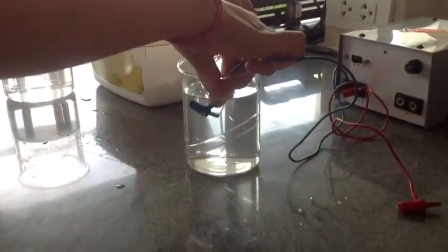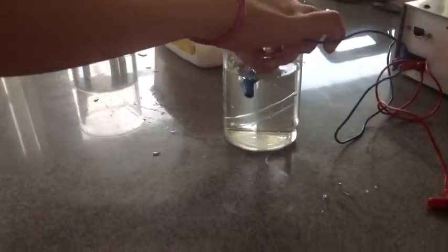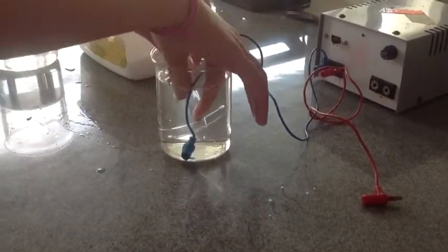The electrodes now have to be underwater inside the small test tubes. Don't plug the power supply yet until you have the electrodes inside the small test tube.